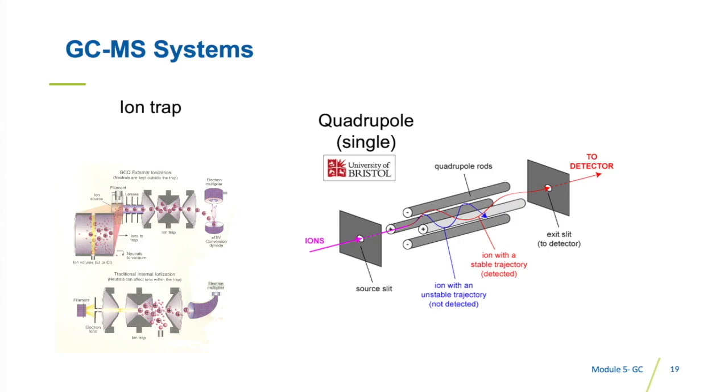The very small size of the sample effectively making it through the GC column sometimes justifies the use of a concentration step, such as an ion trap, which will be discussed in Module 6.